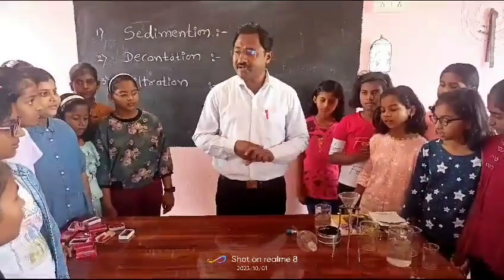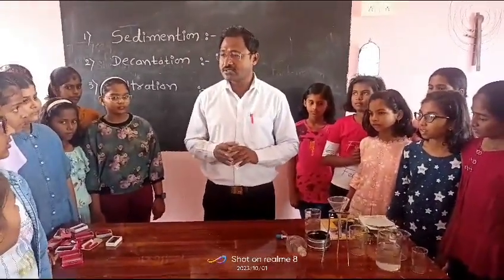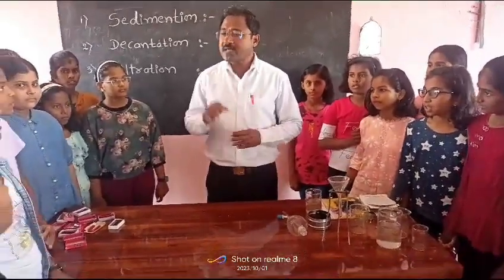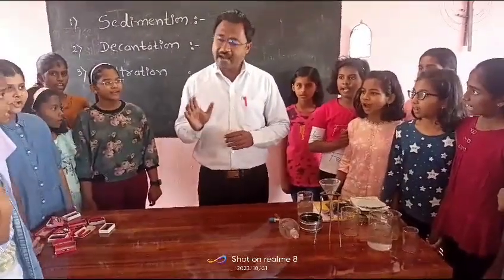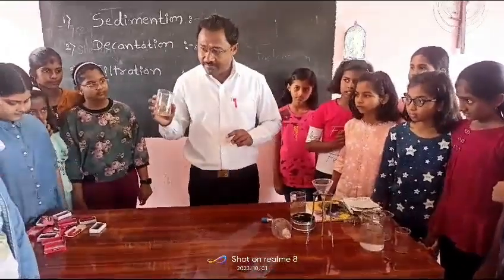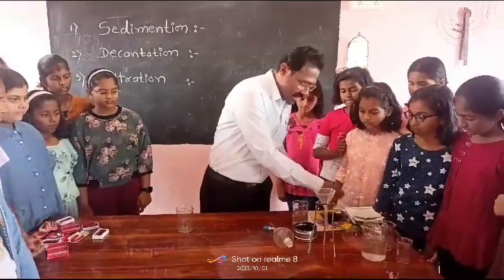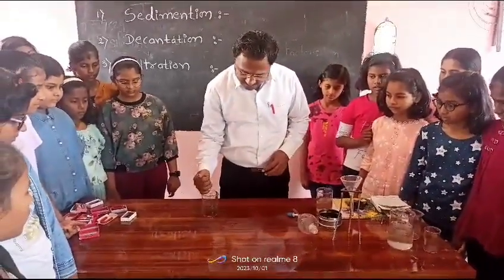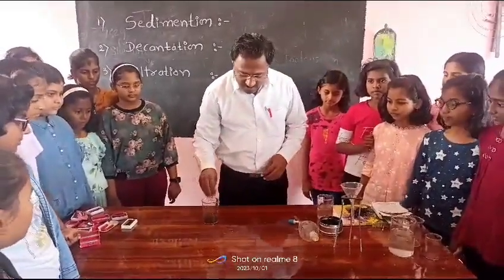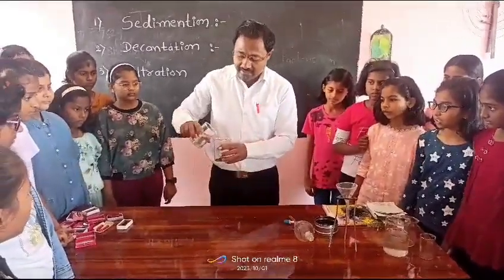Now we can see the separation of substances which are insoluble in water. How can we separate them? With the methods of sedimentation and decantation. Here I take an empty beaker. In that beaker I take some sand. After the sand, I pour some water into that beaker.